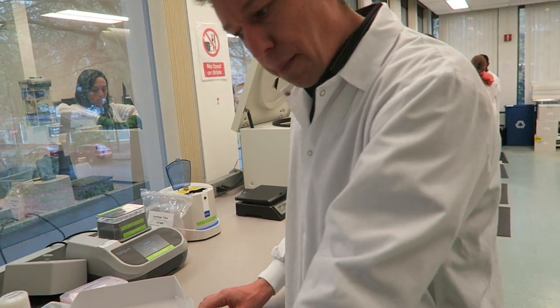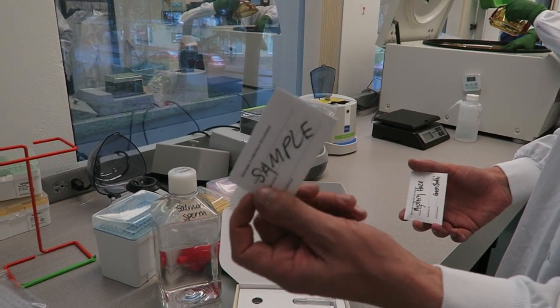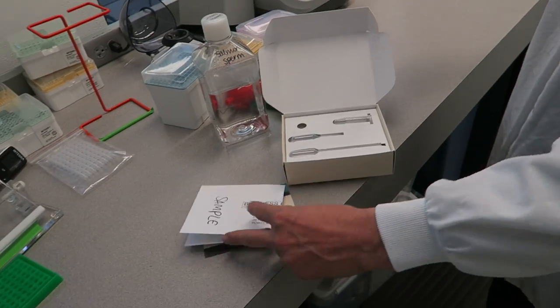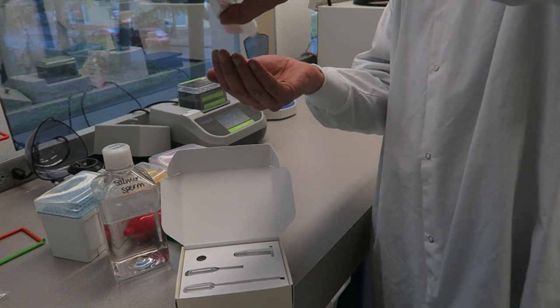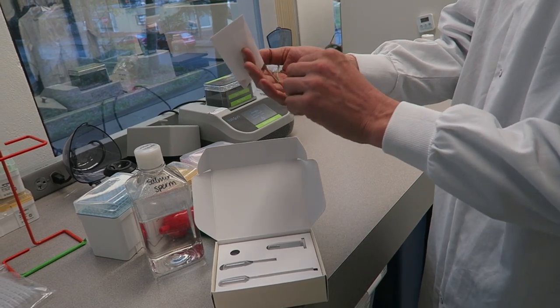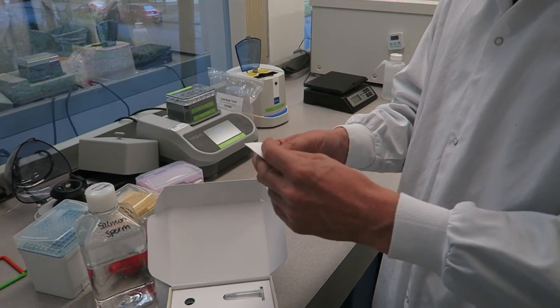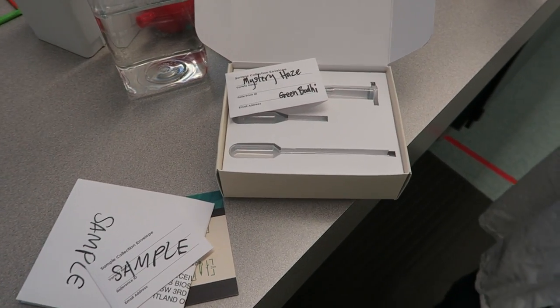Excellent. So you can put it in U.S. mail. And I see you have a little envelope here — that's how you keep these once they get here? So it comes with an envelope that you put in as return business mail. You prep the stem into something like this. This is the sample that we just received — Mystery Haze. That's a great name. Green Bodhi sent this in, and there's the sample. That's all that's sent in and you're able to get the DNA off of that? We extract the DNA and we have a little extra in case there are any issues.